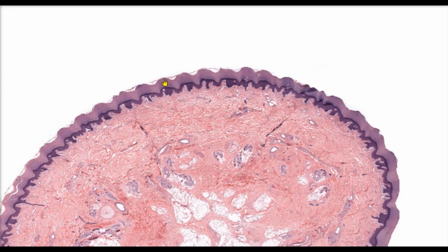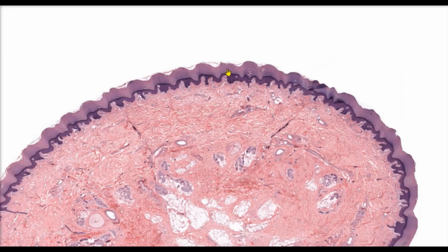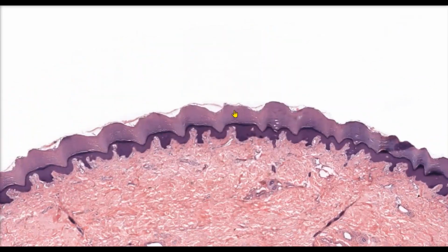The outermost layer, which is shown in this lovely purple color here, is the epidermis. That's going to contain our epithelium. And then the deeper layer, which is this nice pink, is the dermis. We're going to come back and visit the dermis a little bit later. So let's zoom in and focus on our epidermis so we can see this keratinized stratified squamous epithelium.